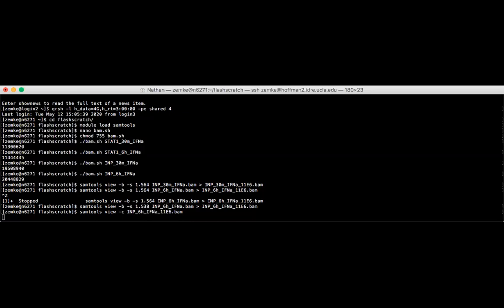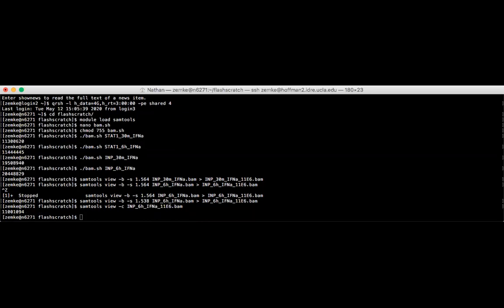It seems like maybe a couple people are stuck. Yeah, so 11 million. I'll try to make it so these BAM files I just made are available to copy into your folder. So give me 1 second.